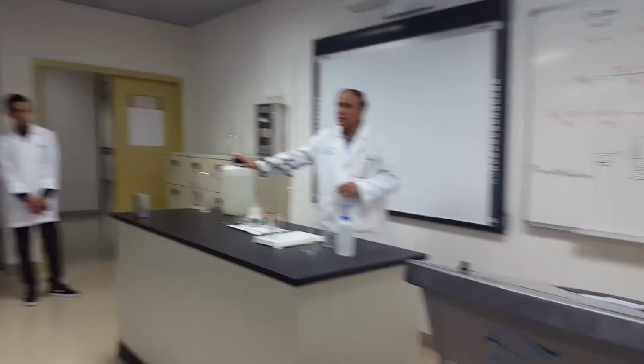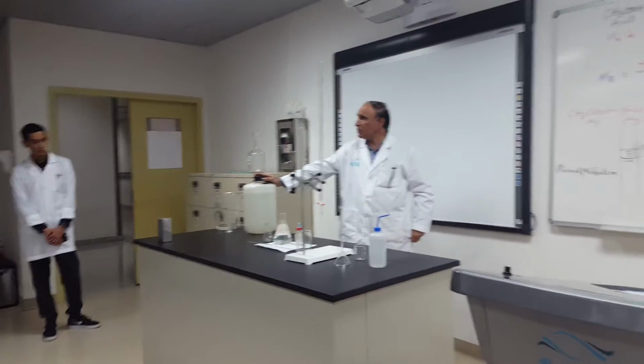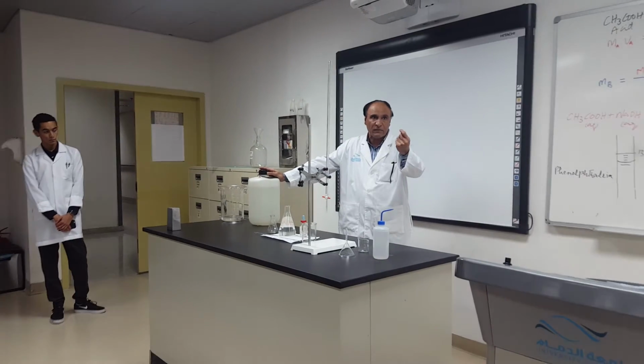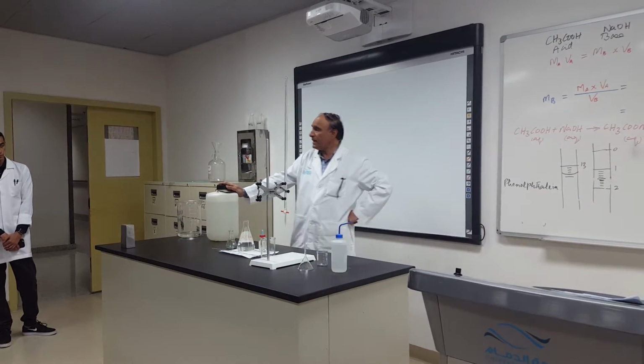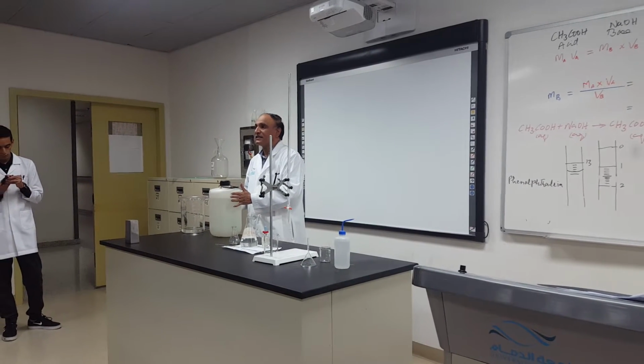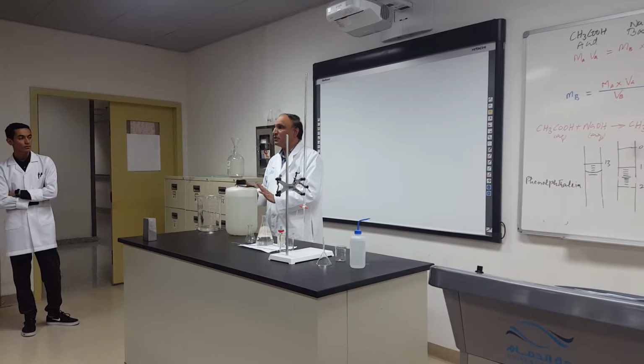This is a solution. I will explain to you. Listen. This is a solution of sodium hydroxide, and its concentration, tarkis, is not known. Yani this is majhul.